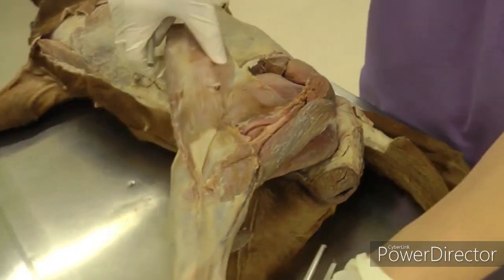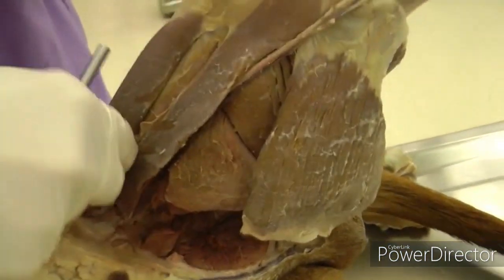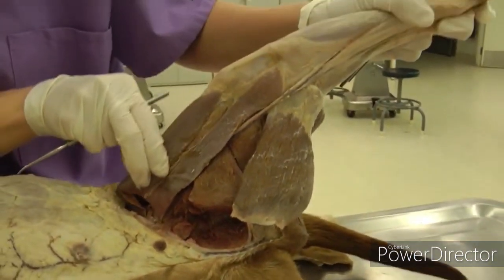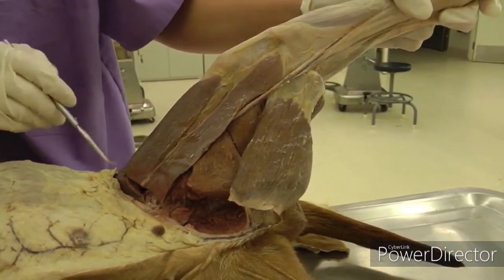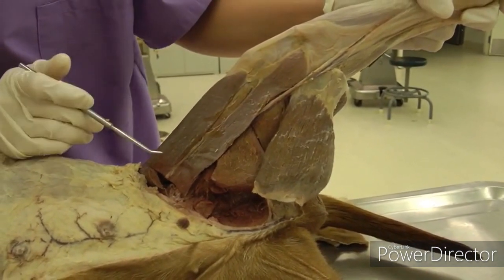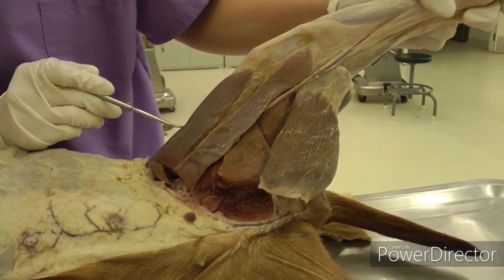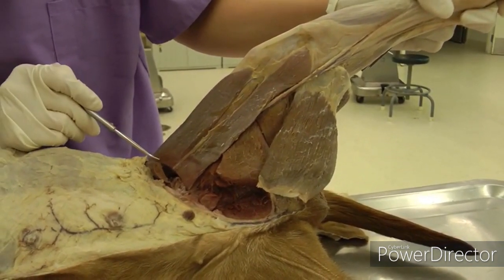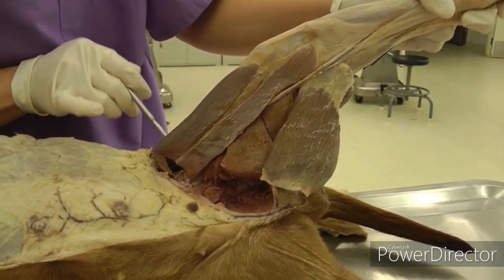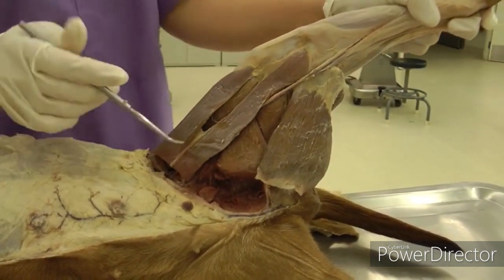Now go to the medial side. Here you have sartorius, which looks like two straps running distally on the leg. In the dog, there is a very distinct cranial and caudal part with a line in between — but the whole thing is sartorius. You're going to define it, then cut across both parts at the same level and reflect them distally on the limb.